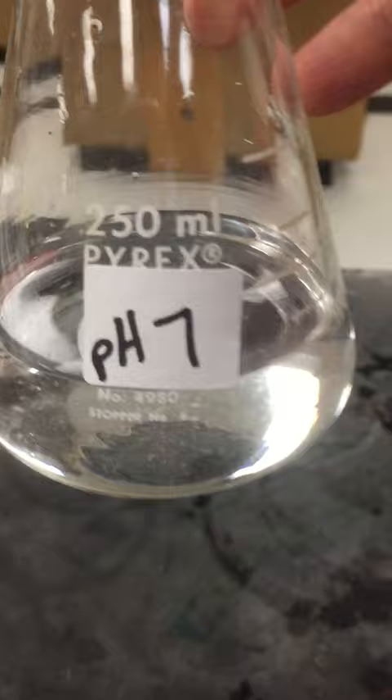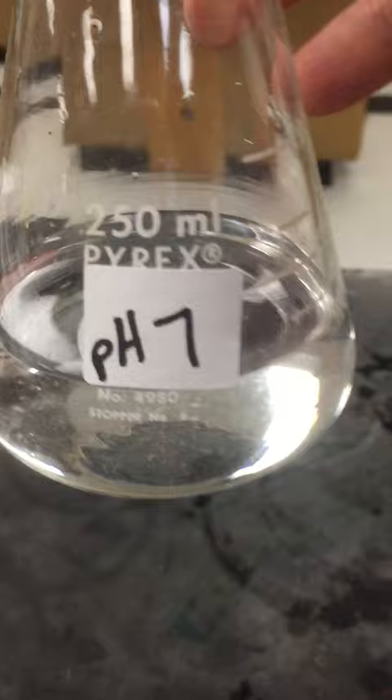Similarly, I did the same thing with pH 7. The only difference is the capsules for pH 7 were green. So here you see I have a pH 4 buffer solution, pH 7 buffer solution, and pH 10 buffer solution.